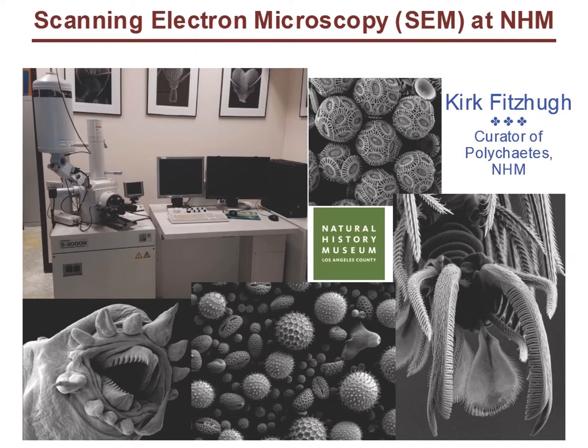Our SEM is not currently on display for the public to see, but you've probably seen photos that have been taken using an SEM, like those shown here, of microscopic animals, plants, and other objects. Such images are striking because of their clarity and having an almost three-dimensional appearance.